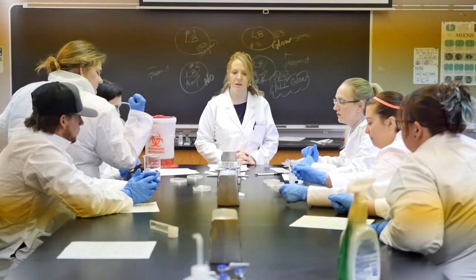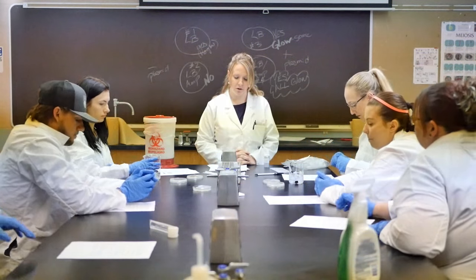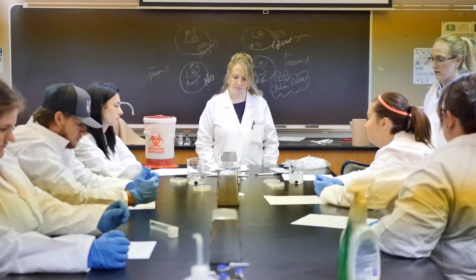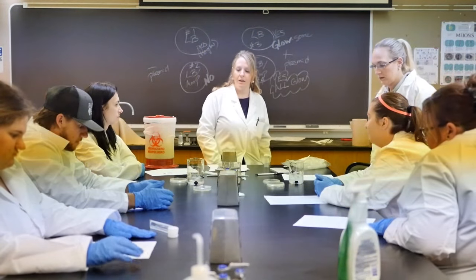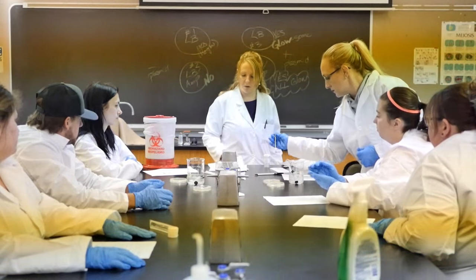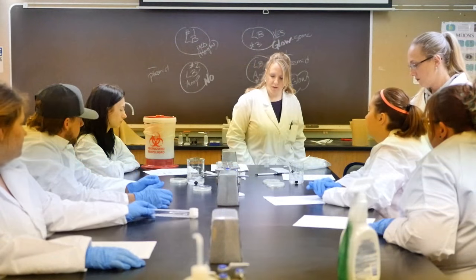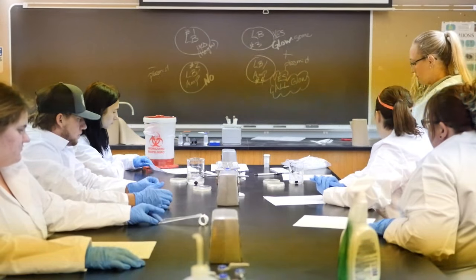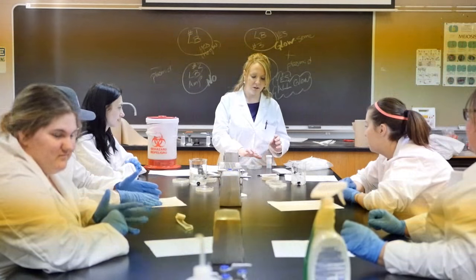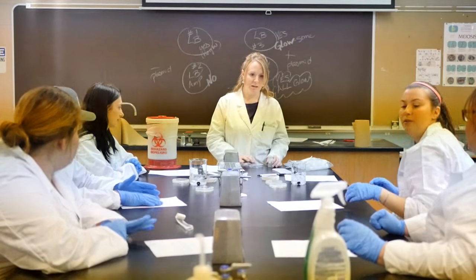Okay, so we will give this 6 or 7 minutes for recovery at room temperature. In the meantime, I'll go over some plating with you guys before those 6 minutes are up. I'm going to show you how to do the little glass bead thing here.